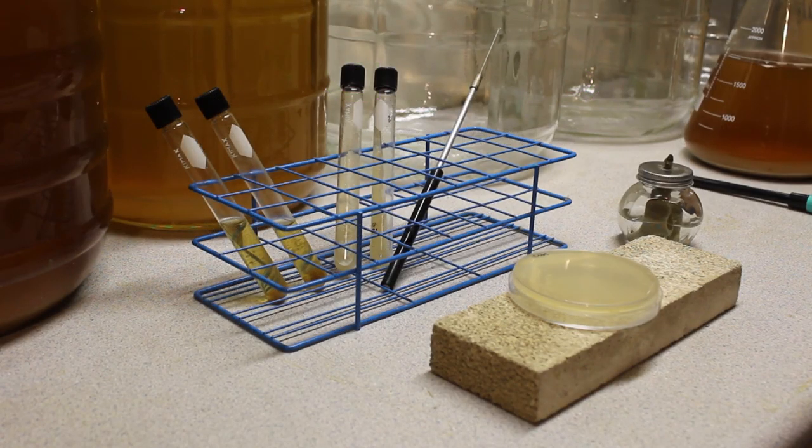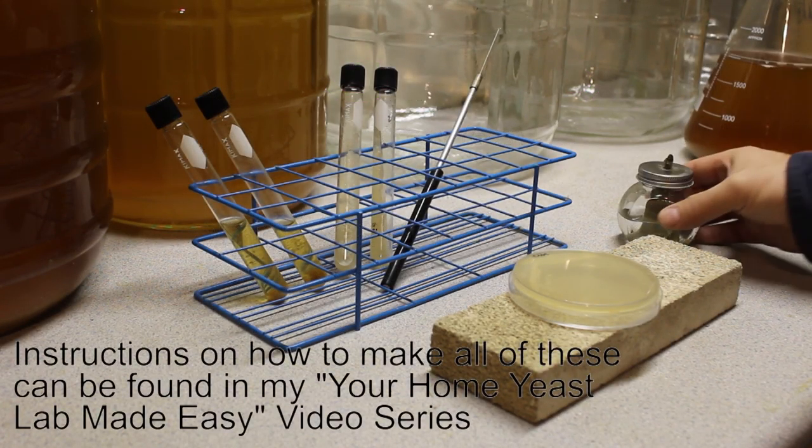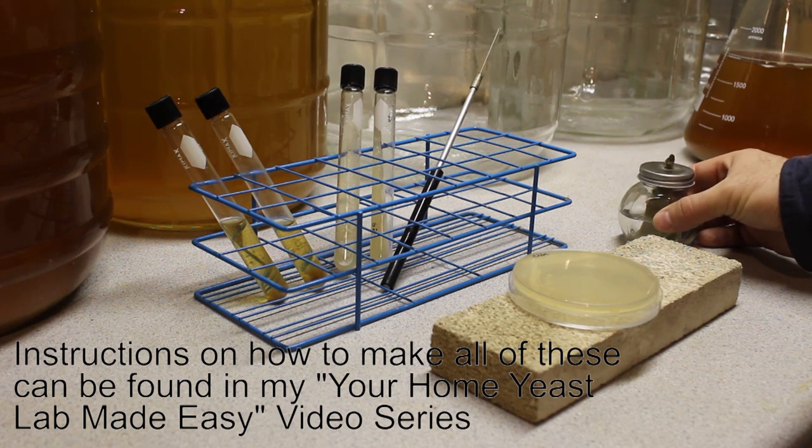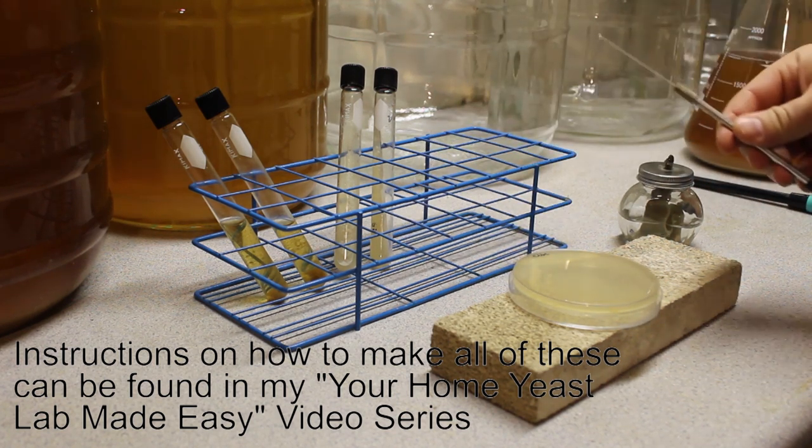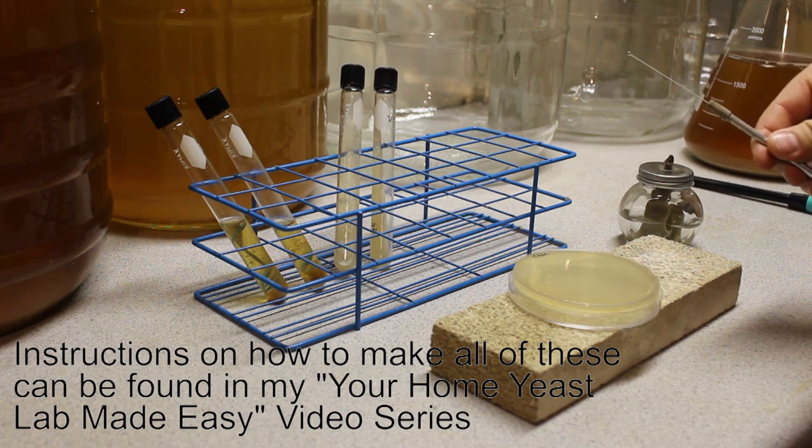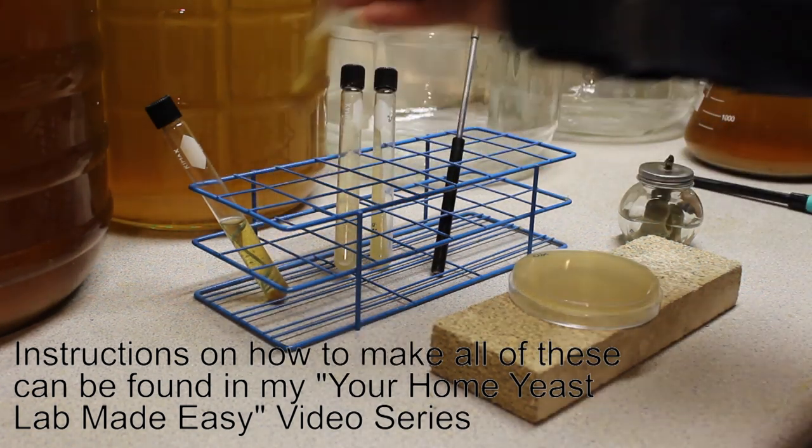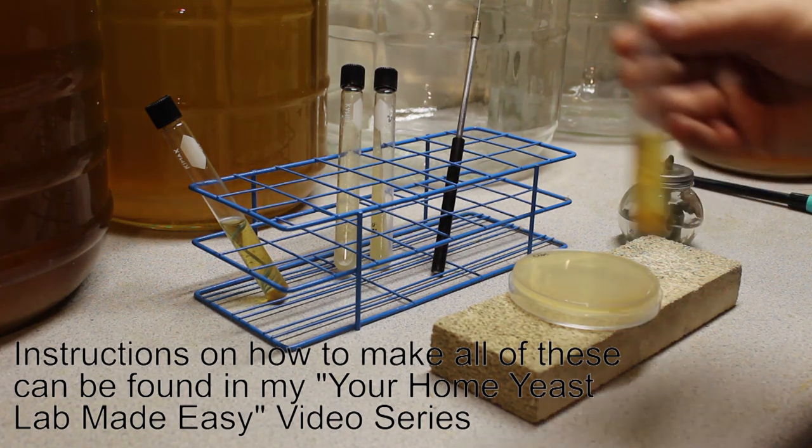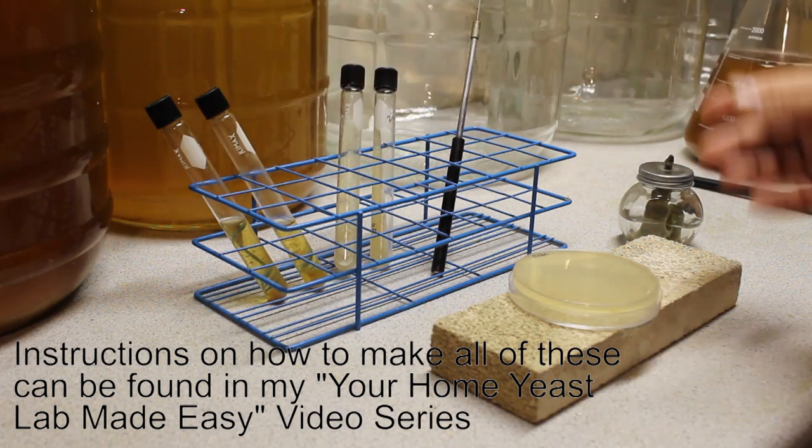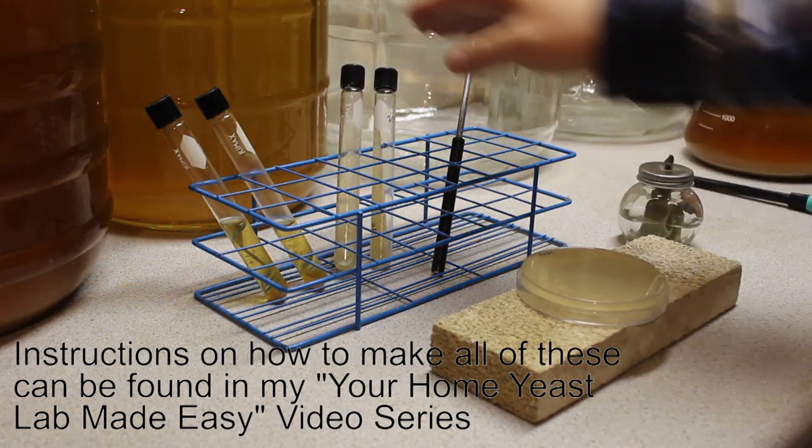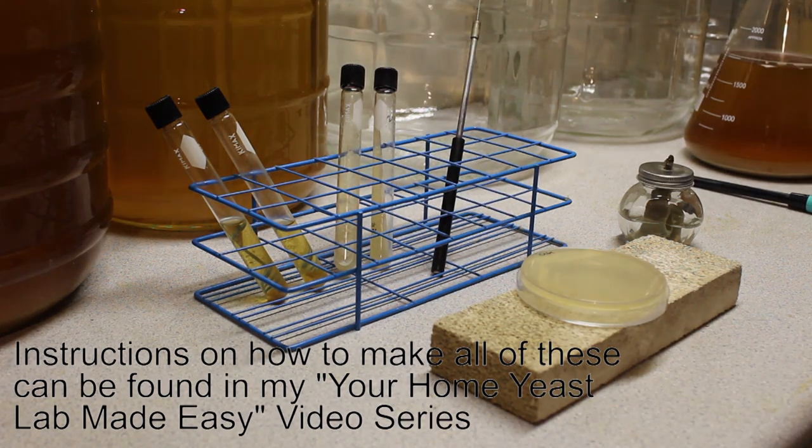For this procedure you're going to need a few items. You're going to need a Bunsen burner or alcohol lamp. You're going to need a bacteriological loop or a paper clip bent into a ring. You're going to need some tubes of starter wort that's sterile, and you're going to need a source of yeast, either an agar plate or some agar slants.